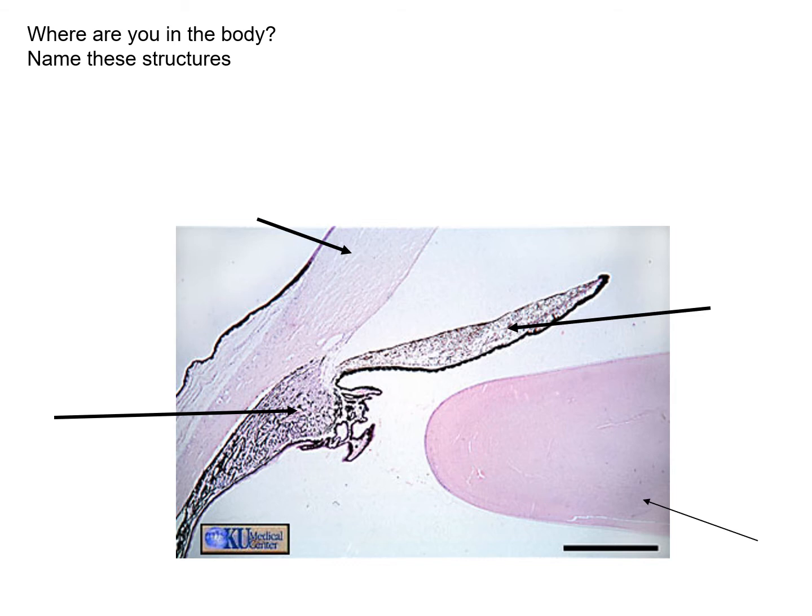That's the eye. It is the eye. If you were to start at the top arrow and go clockwise, could you tell me the structures they're pointing to? Is the first one the lens? The first one up at the top, the cornea? That would be the cornea, yes.